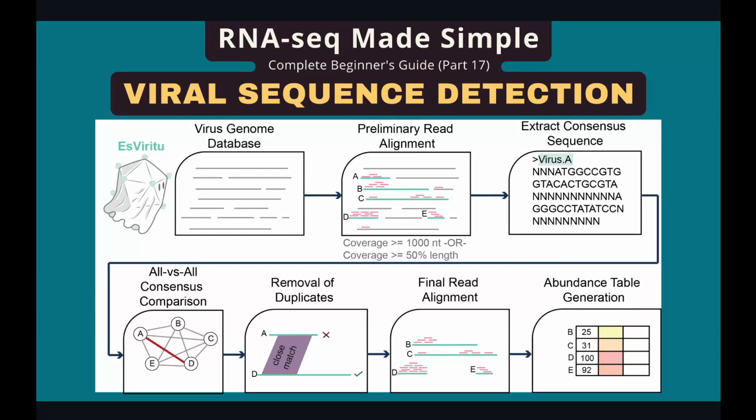In this video, I'm going to show you how to detect viral sequences in regular RNA sequencing data. So why do we need to identify viral sequences? Well, when we extract RNAs from our tissues, we inevitably introduce foreign RNAs from our environments. For example, from human tissues, mice, bacteria, or viruses. Among them, some are contaminations, and some are functional.